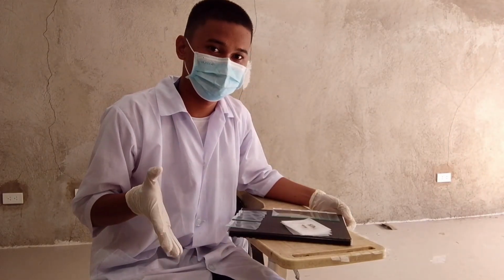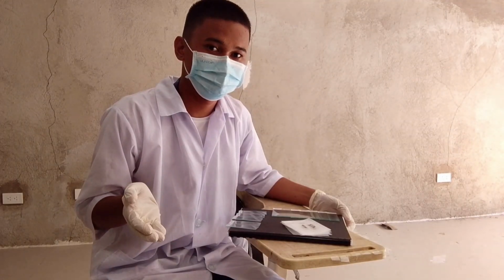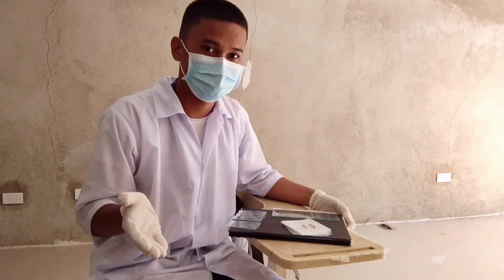For the next procedure, I will put the samples of human and animal hair on glass slides.